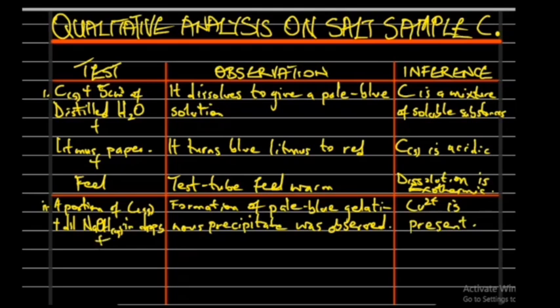Then, with a portion of C plus dilute sodium hydroxide in excess, we discover that the precipitate remains insoluble.